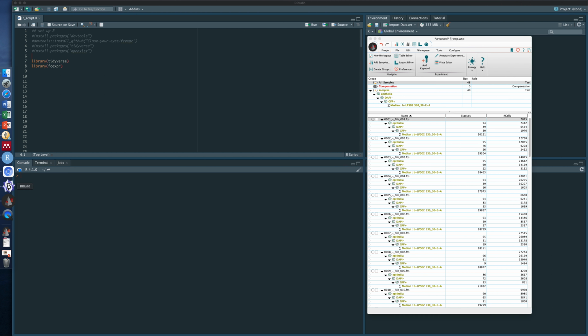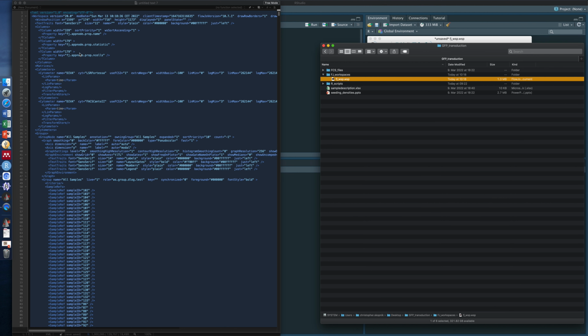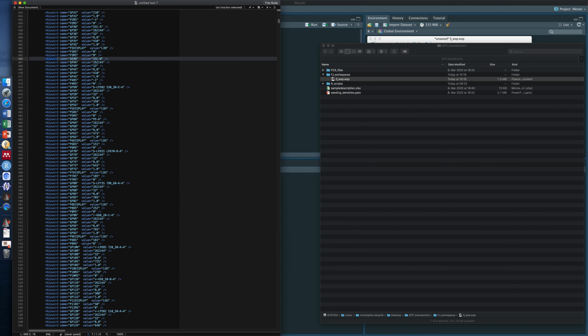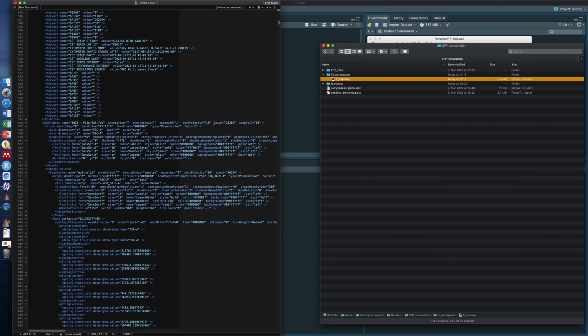The important thing to recognize is that these workspace files come in the XML format, so a very hierarchical file format. You can see here it is an XML. And a lot of information is really hard-coded and saved to disk. For example, if we scroll down here, we can see that all these keywords from our FCS files are saved within this file. And moreover, I can also see that counts appear here, like this one or that one. And it is possible to extract these counts independent of the FCS files. And this is what I'm going to show you with the function in R.